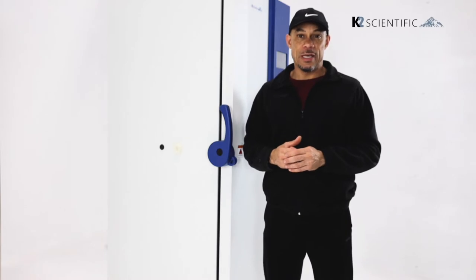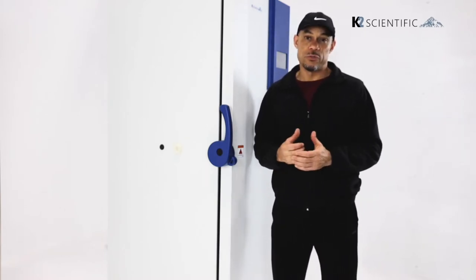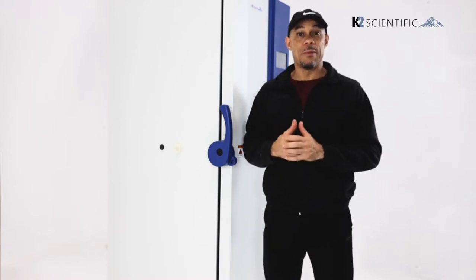Hi, I'm Mark from K2 Scientific and I'm here with the K221ULT. It's a 21 cubic foot ultra-low freezer. In this video I'm going to go over how to properly operate the door handle.